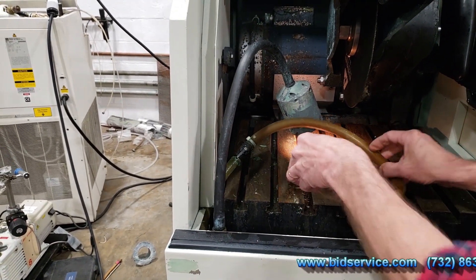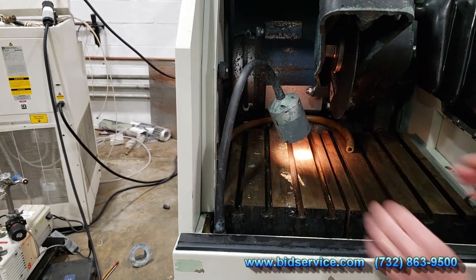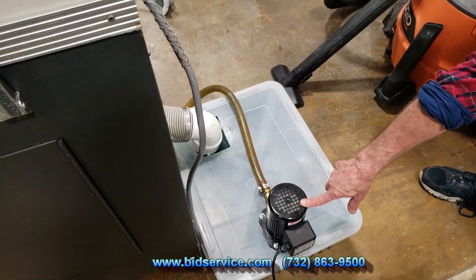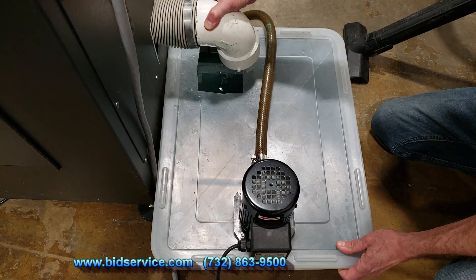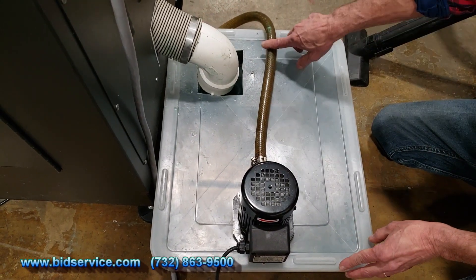I just want to point out where our recirculating coolant tank is — we have it hooked up in the back here. There are two weirs internal inside here, and then we have our drain leading into the opening in the tank. This is the feed line coming in.